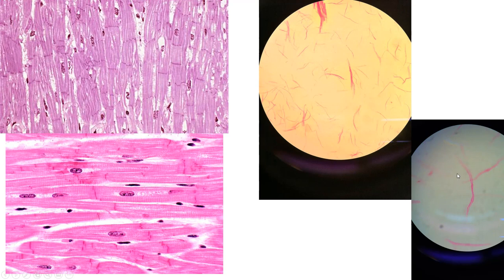Moving into smooth muscle, specifically this is teased smooth muscle, meaning the fibers have been isolated. And so it looks like a bunch of threads. If we zoom in, we kind of see a few like this. Fusiform appearance, like fat in the middle, tapered on the ends. That's what teased smooth muscle will look like.